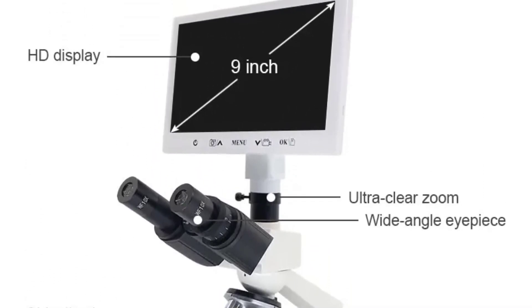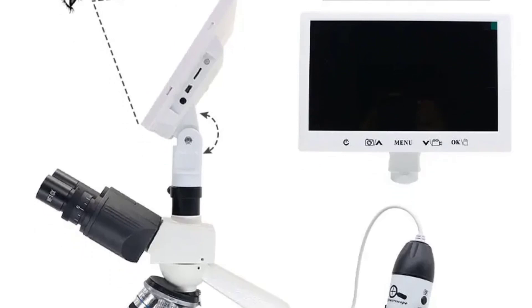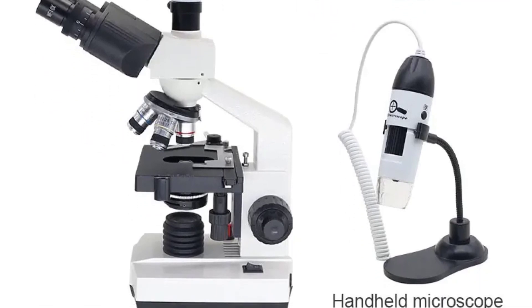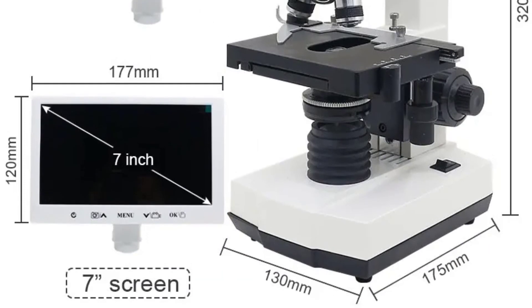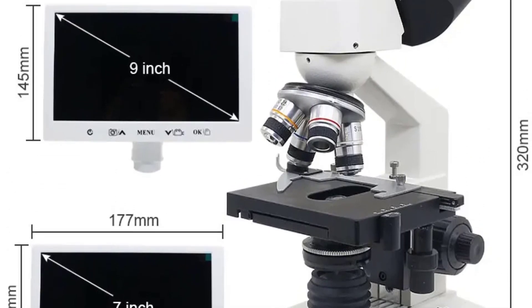Equipped with a powerful magnification range of 40x to 1600x, this microscope allows users to delve into the finest details of specimens with unparalleled clarity. The combination of WF-10x and WF-16x eyepieces, along with 4x, 10x, 40x, and 100x objectives, offers flexibility in magnification, catering to a diverse range of scientific and educational needs.